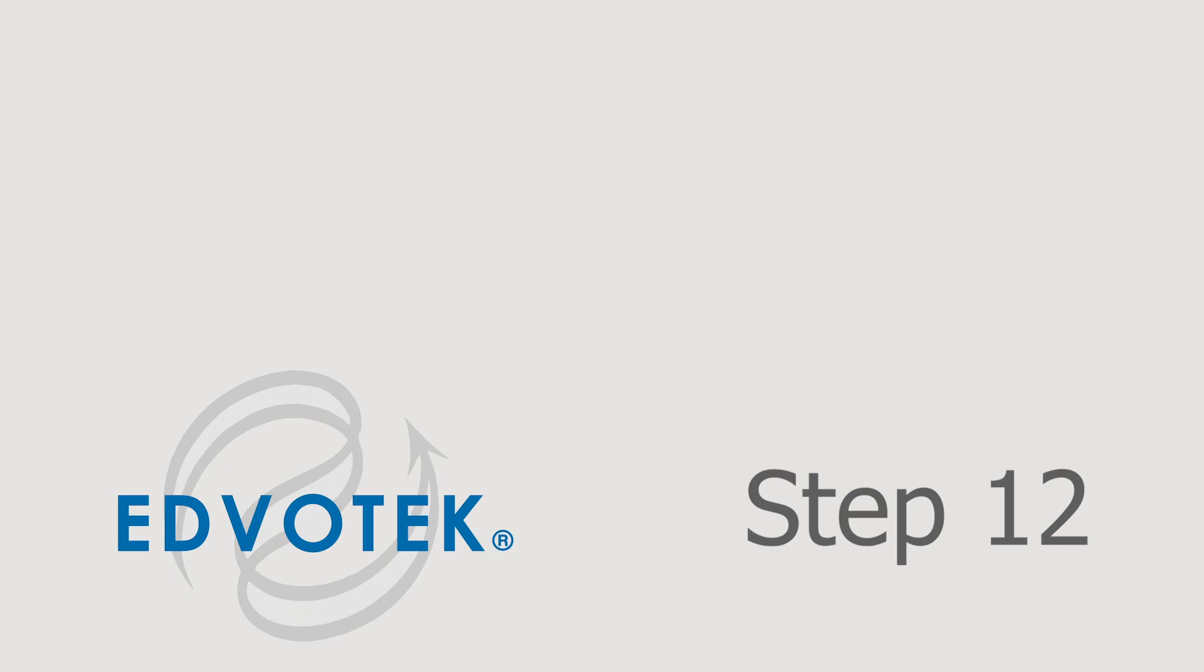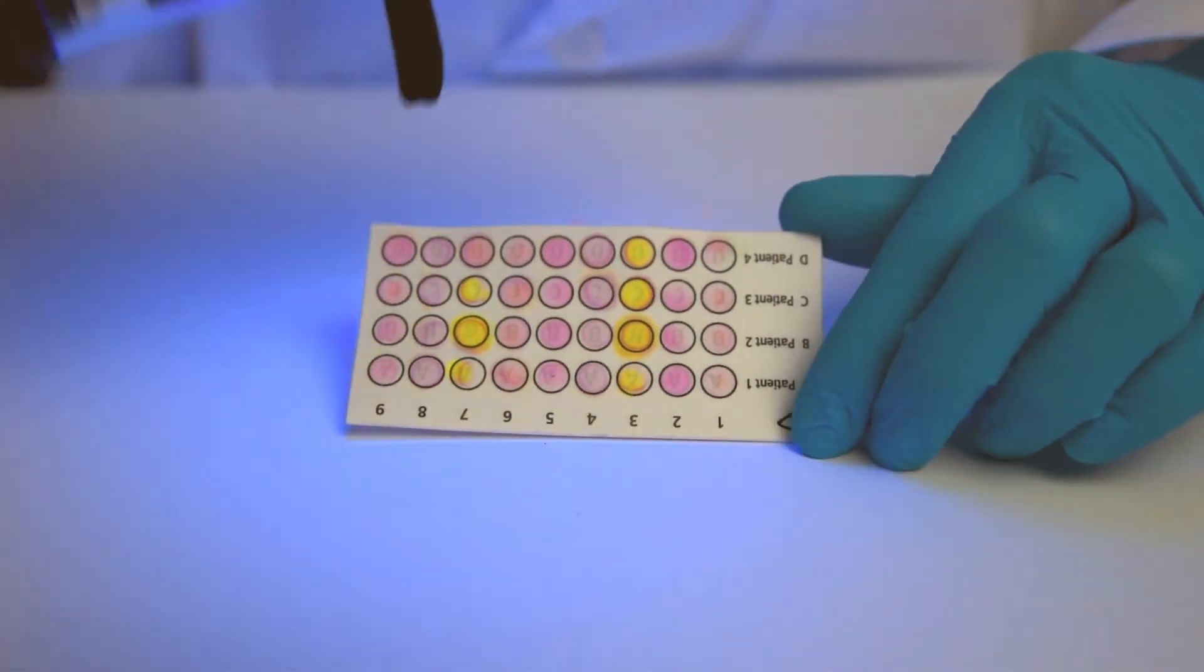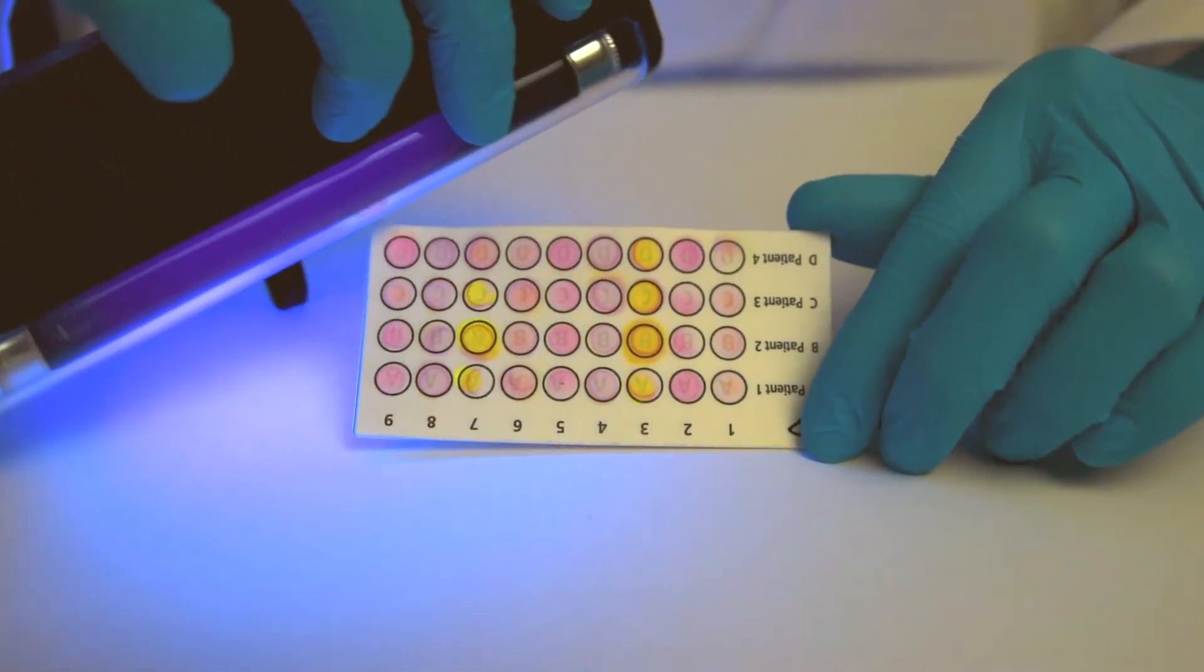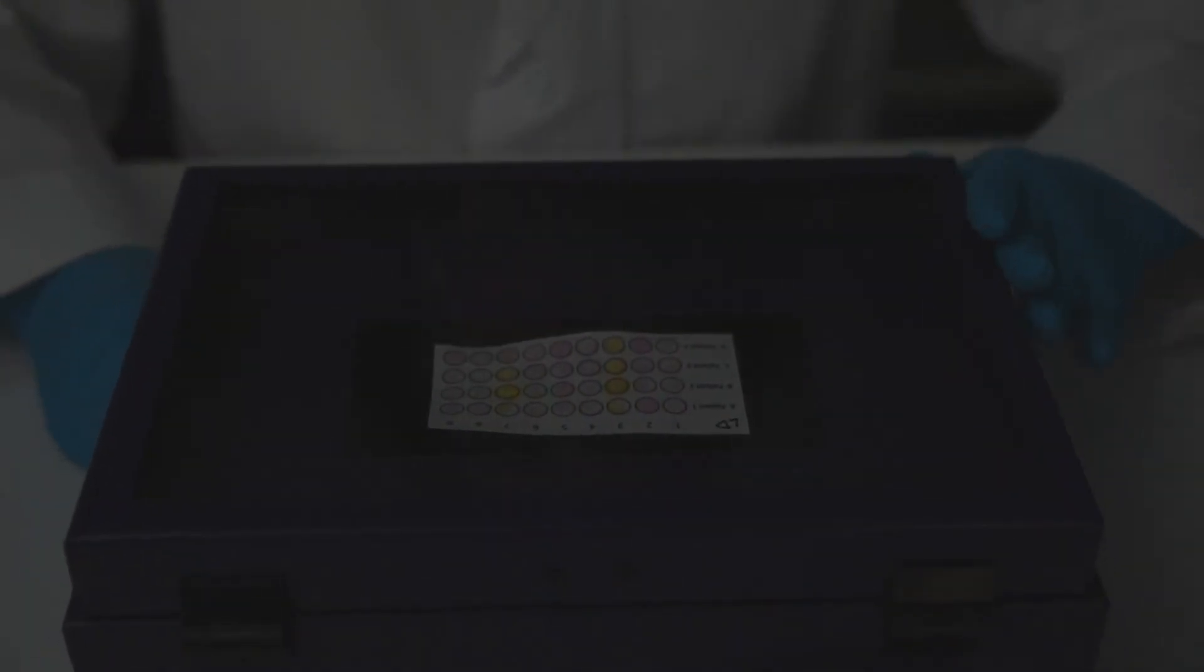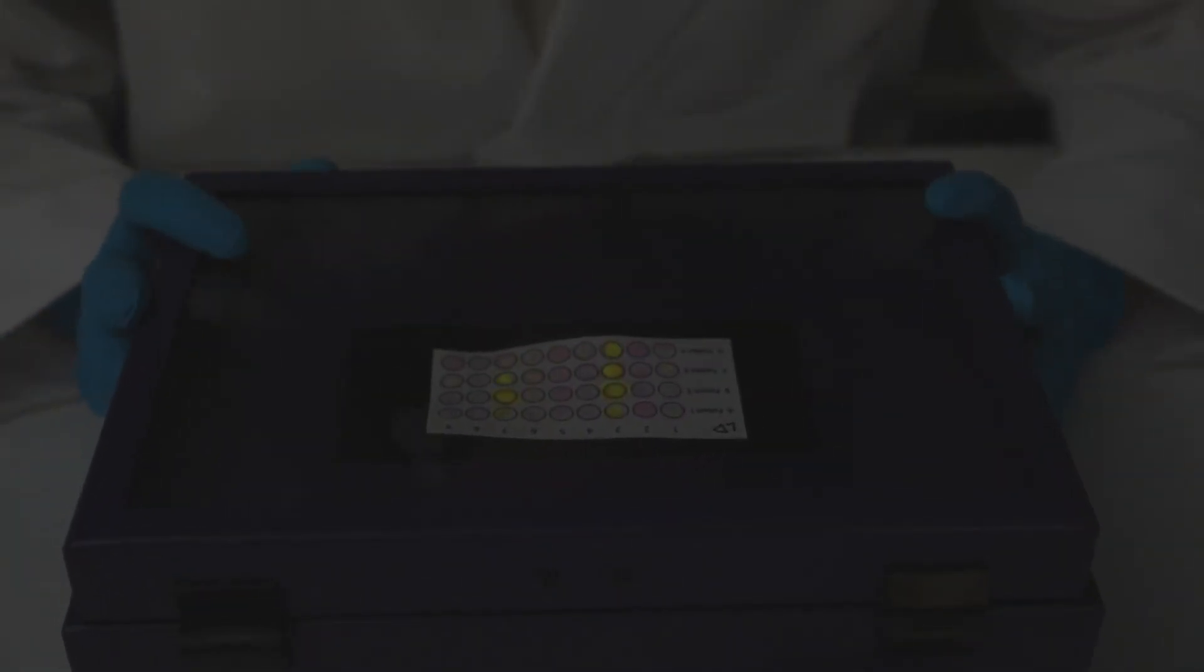Step 12. Visualize the microarray card using a long-wave handheld UV light or mid-range UV transilluminator. Microarray cards can be stored and analyzed for up to one week if protected from light.